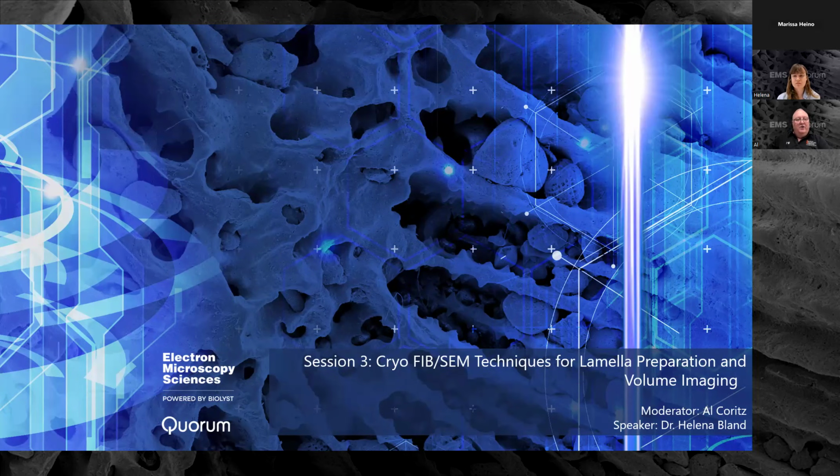Dr. Bland joined Quorum Technologies as an application specialist in 2024. She completed her integrated master's degree in chemistry with biological and medicinal chemistry at the University of York. Following her degree, she worked as a research assistant at the University of Helsinki, specializing in carbohydrate synthesis.